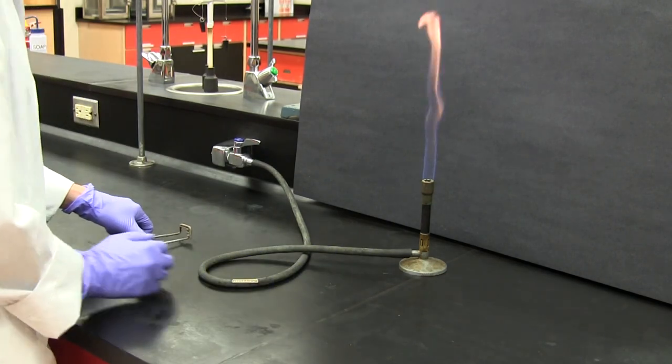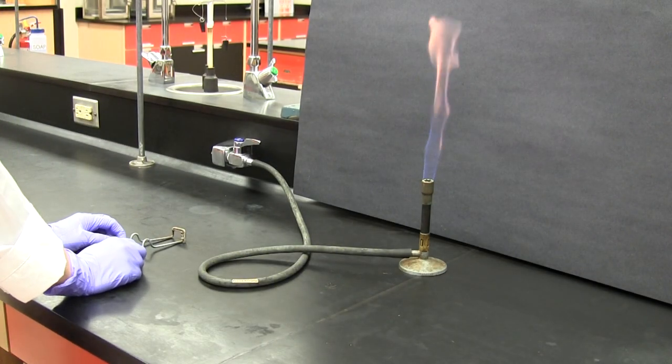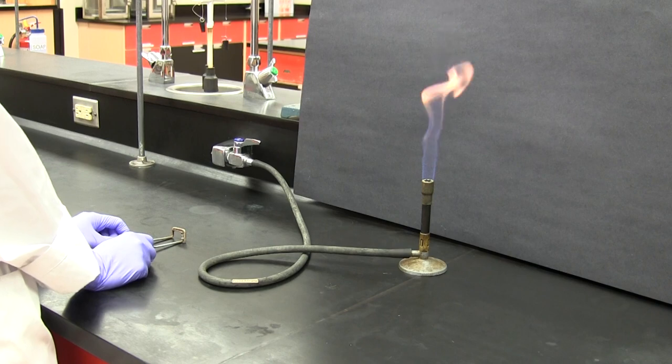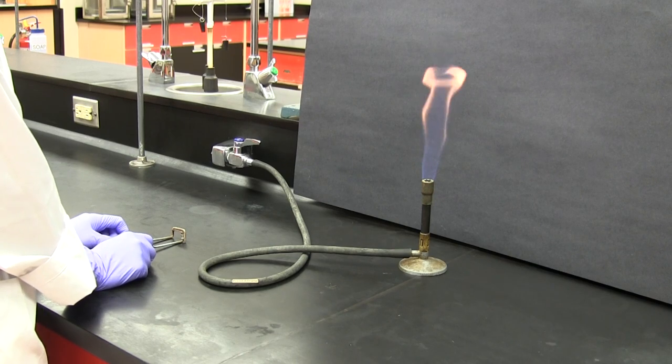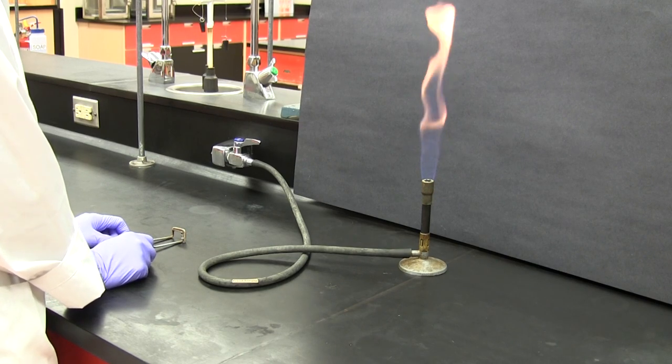Notice that when the gas is first ignited, the flame produced has a yellow color. This indicates that the gas isn't burning efficiently and it's producing a lot of carbon.